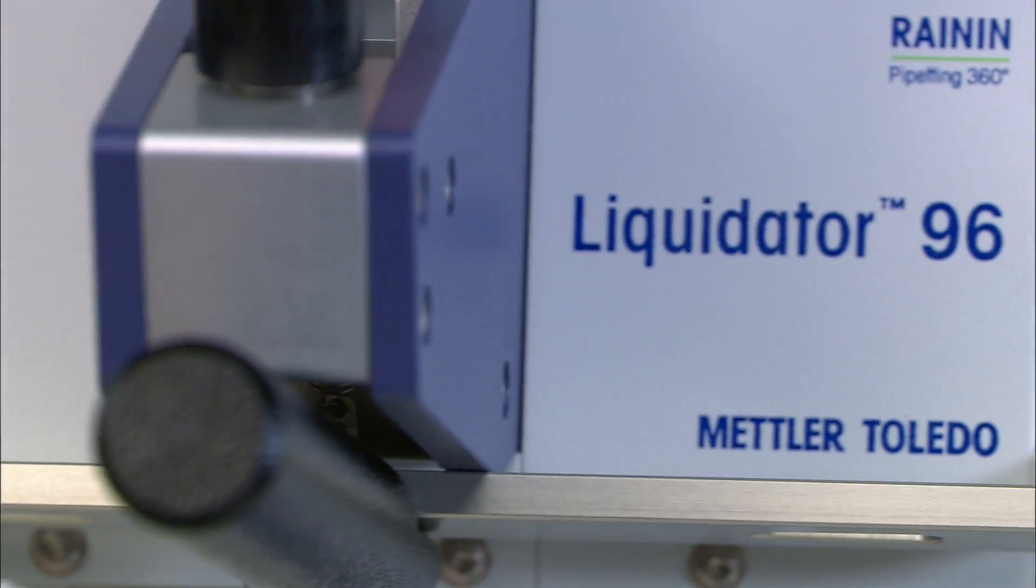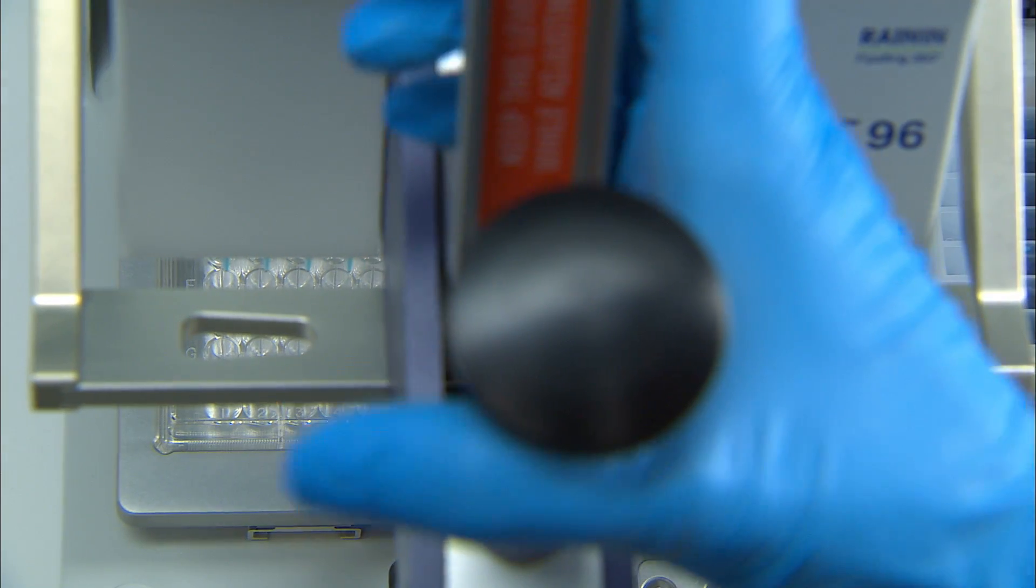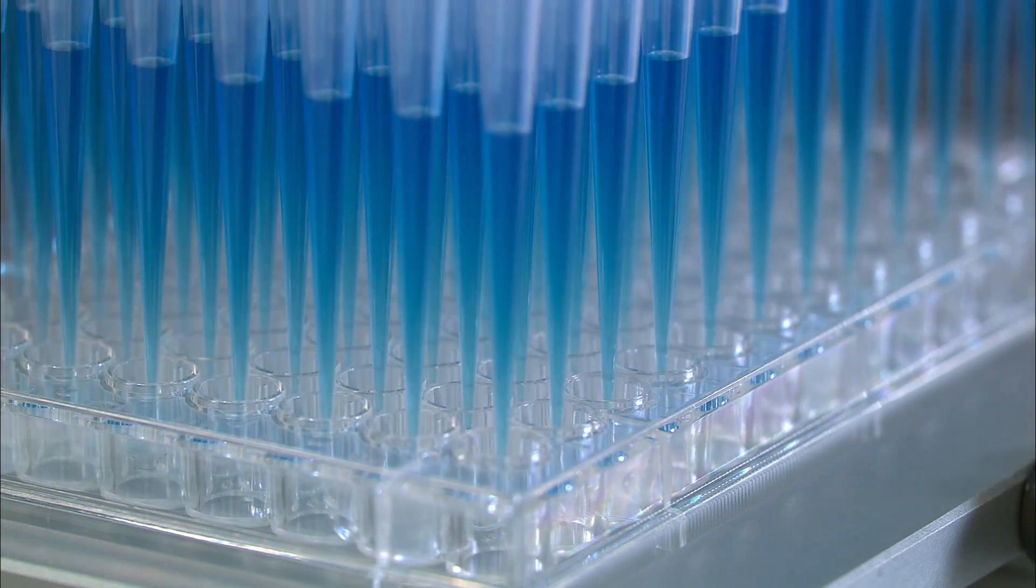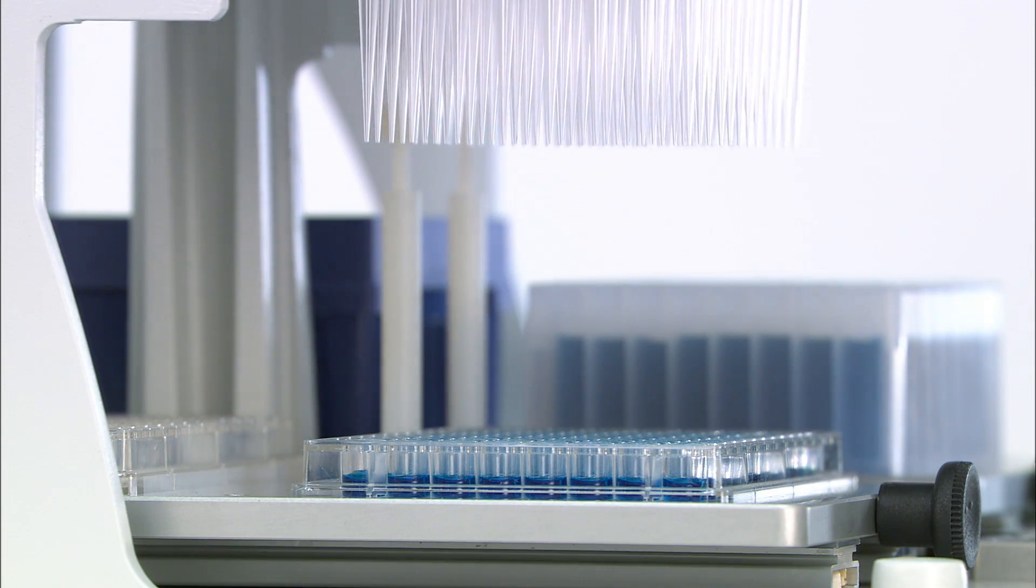The Liquidator 96 is a compact manual benchtop pipetter. It's ideal for a wide range of applications and requires no electricity, computer programming, or complicated robots.